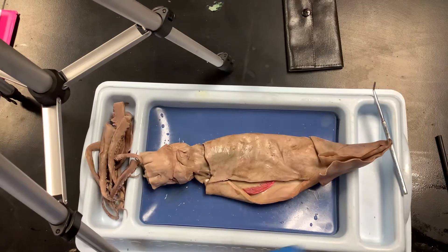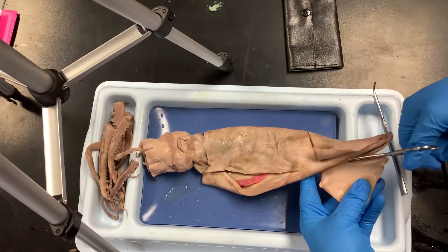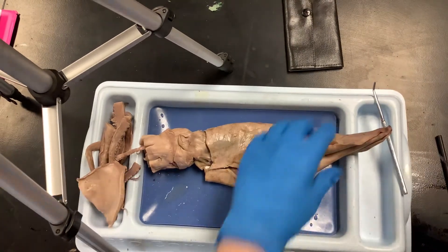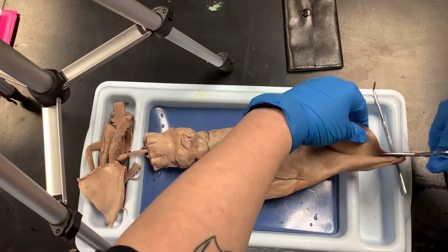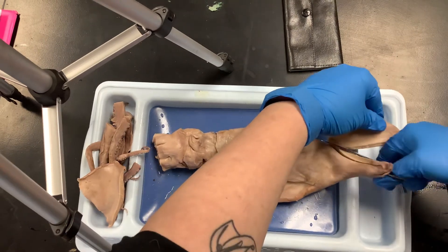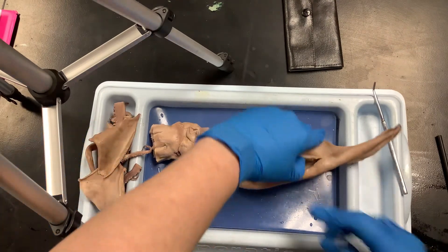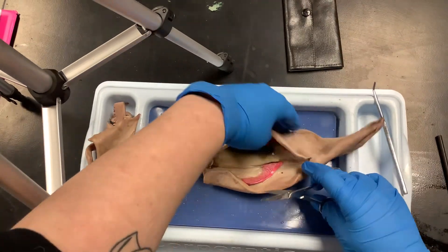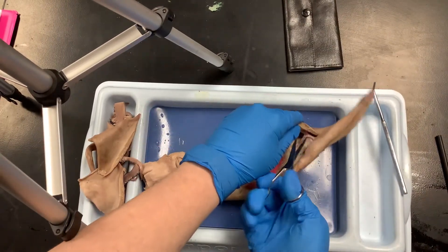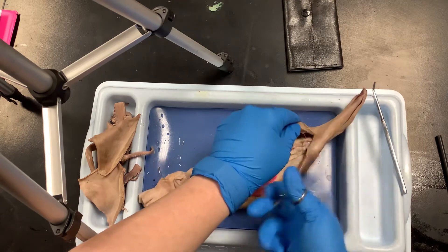I'm going to cut the lateral fins off because they're getting in my way — you can do the same if you'd like. Cut as far up as you can. There are no organs in the top portion, but we might be able to see the pen. I cut mine off so it would lay down a little bit better.